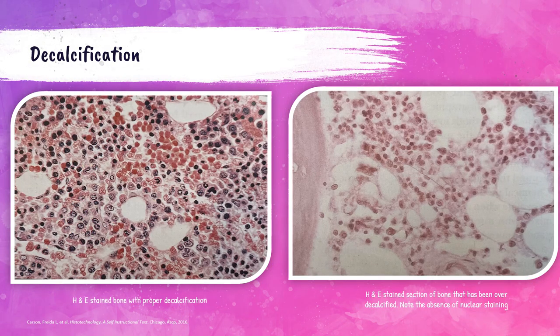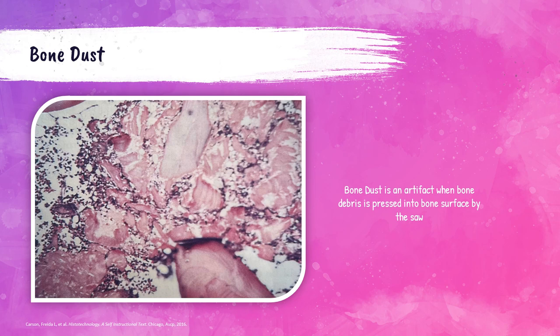A bone section stained with H&E shows a properly decalcified specimen with preserved nuclear basophilia; red and white blood cell lines can be easily distinguished. Another H&E-stained bone section shows over-decalcification, where there is no nuclear staining. A photo also shows bone dust artifact, which occurs when bone debris is pressed into the bone surface by the saw; this can be prevented by using a saw with a diamond blade, which allows thin sections to be cut without debris.